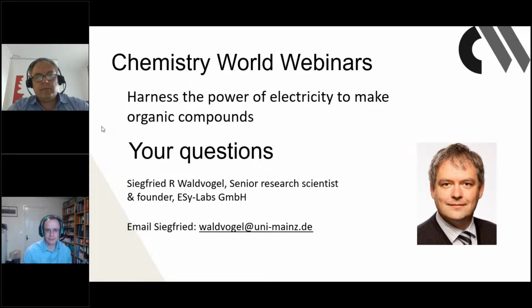Okay, that's a great answer. Thanks very much. Okay, so the next question we have is from Jean, and he says, is it possible to scale up electrosynthesis under potentiostatic conditions?